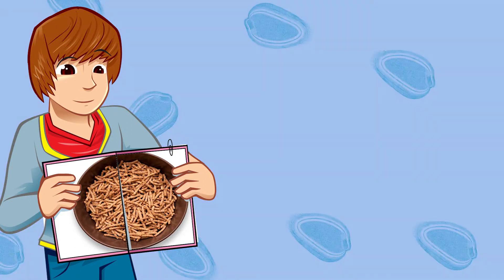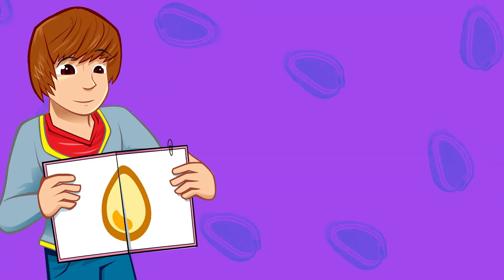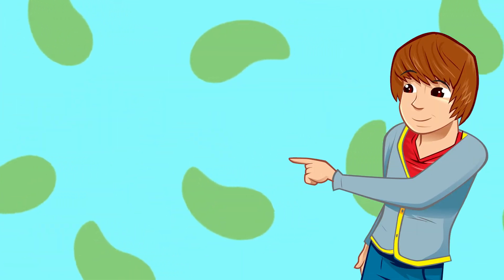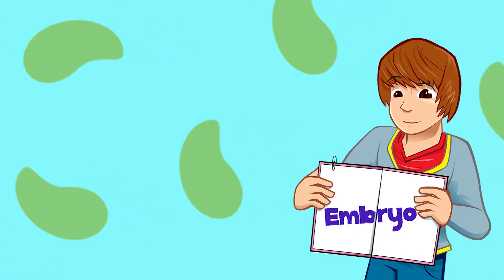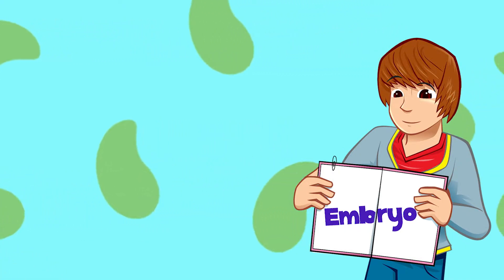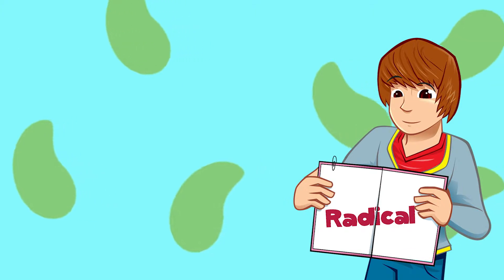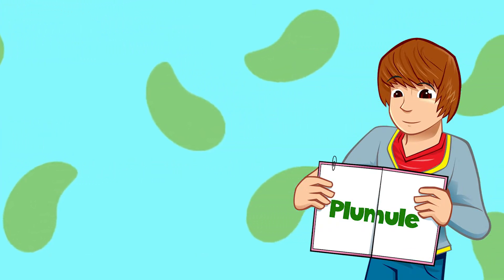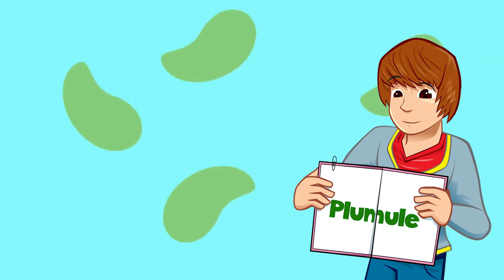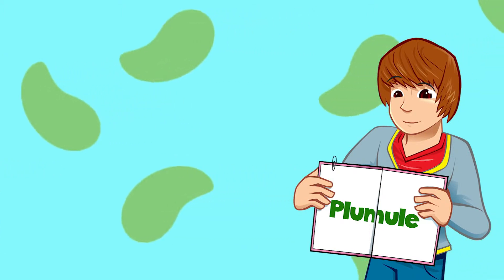Now we can see the two parts that are inside. The smaller part is called the germ whilst the larger part is called the endosperm. The germ is the embryo of the plant — the tiny soft centre. It contains something called a radicle, which is the start of its root system, and a plumule which develops into stems, leaves and ears of a new wheat plant.